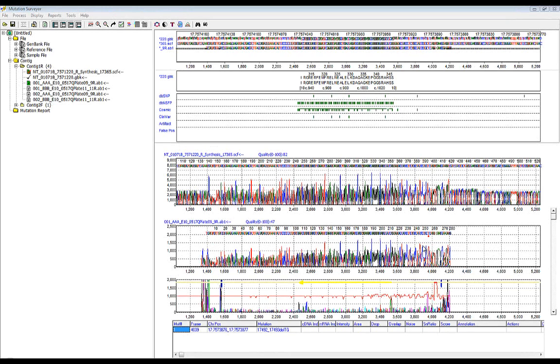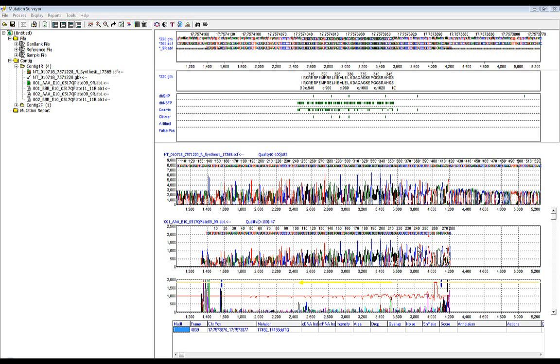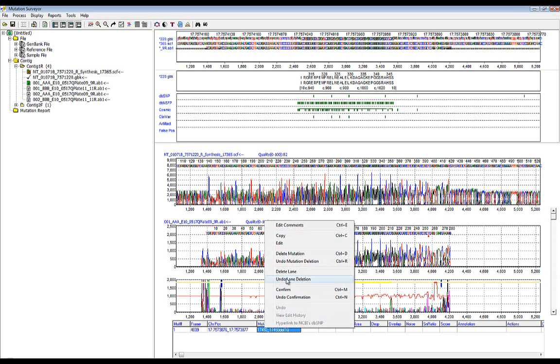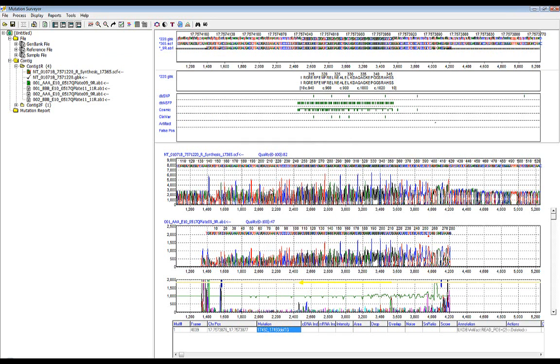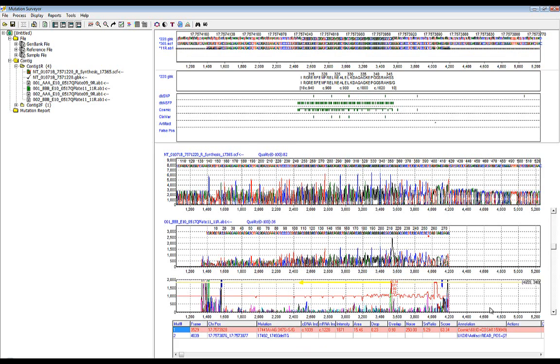Before moving to the next section of the webinar, I would like to review some important differences between false positives and artifacts. These two knowledge base entries store different information in the database, and as a result, are best used in different circumstances. Artifact entries are designed to track sequencing artifacts, and as a result, the knowledge base stores the mutation call, chromosome position, and read position of the entry. In this way, Mutation Surveyor will track each artifact entry relative to its trace position to recognize if the entry is at the beginning, middle, or end of a sequencing trace. This helps the program distinguish between real variants in the middle of an amplicon and artifacts located at the end of an overlapping amplicon.